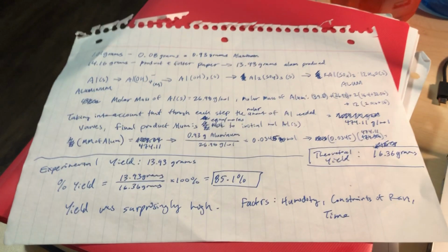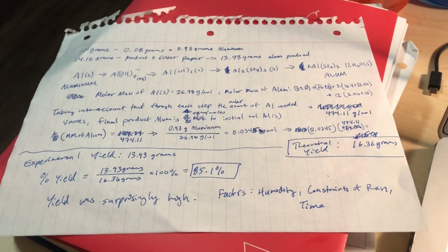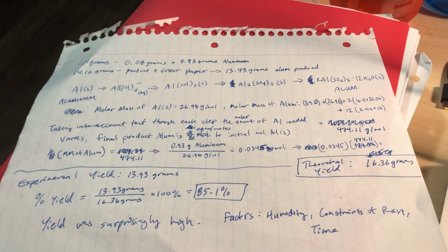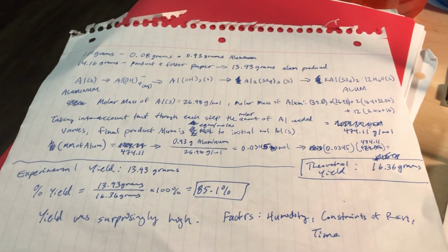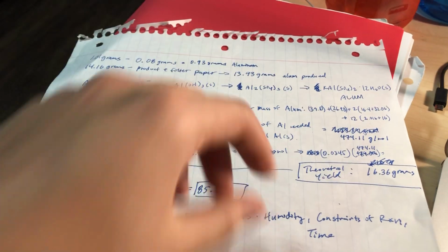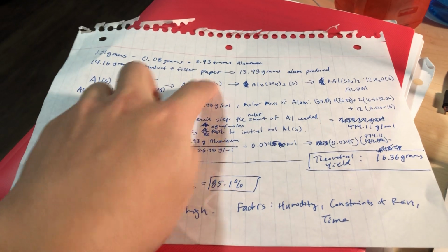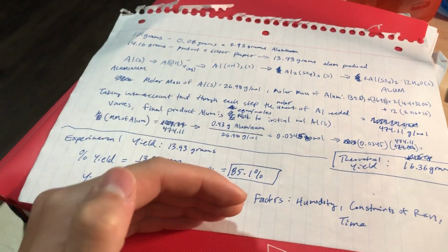So the yield was actually surprisingly high, in my opinion, and it varies depending on the reaction and all the constraints of the reaction. So, temperature, time, the humidity, there's a lot of different constraints. So we worked with this, and we filtered it, and we had to let it sit on a hot plate. We had to let it redissolve. So if at any stage the reaction doesn't occur fully, then you'll never be able to get your theoretical yield. So every step, each of the 4 steps in the previous video, has to be fully completed. So here to here has to be 100% yield, then 100%, then 100%, then finally 100% again, for this to be a final experimental yield that's equal to the theoretical.